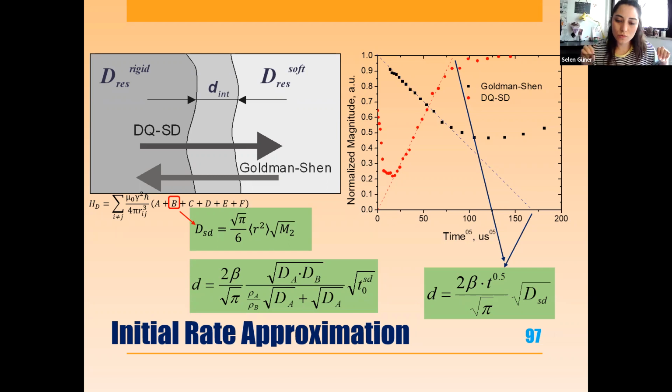To make a comparison between two different samples, for example, we fit our data first, and then we comment on the constants of our fitting, right? Yeah, but for different samples, we need to look at all of them initially, to develop the same settings for all samples. Then we will have the right to compare them. Otherwise, it's not good. Look at the FIDs of all samples and the MSC of all samples. Then we discuss how we organize this transfer.